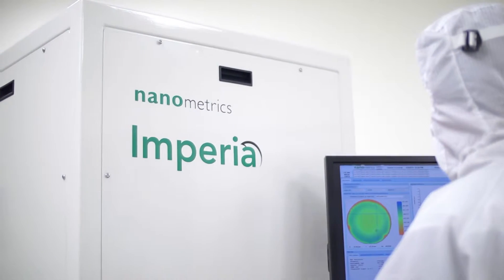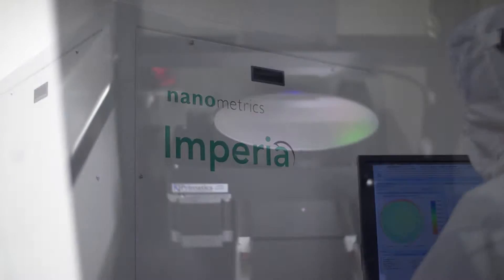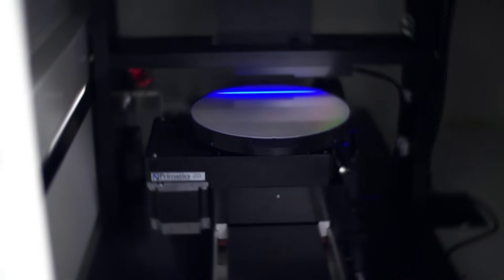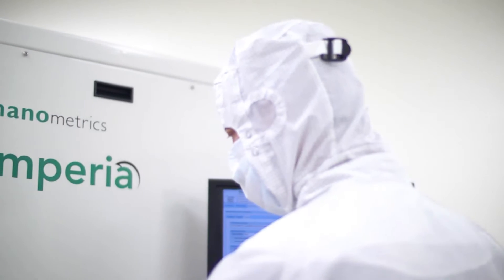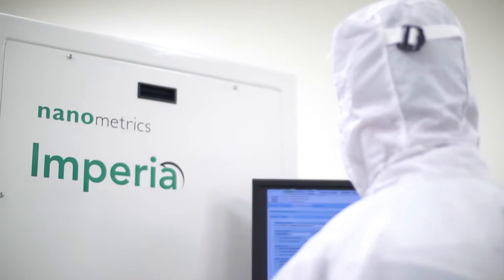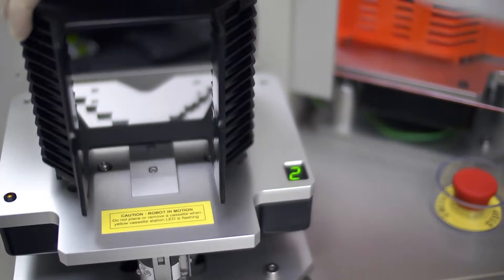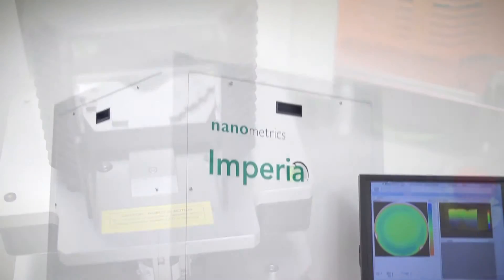Introducing the Imperia Photoluminescence Imaging System from Nanometrics. With its unique optical design technology, Imperia detects and classifies yield-killing defects with the additional benefit of simultaneous state-of-the-art photoluminescence production monitoring.